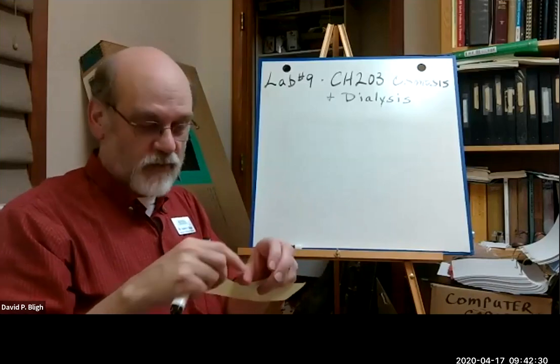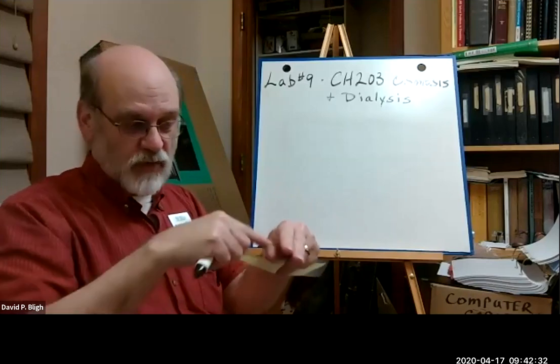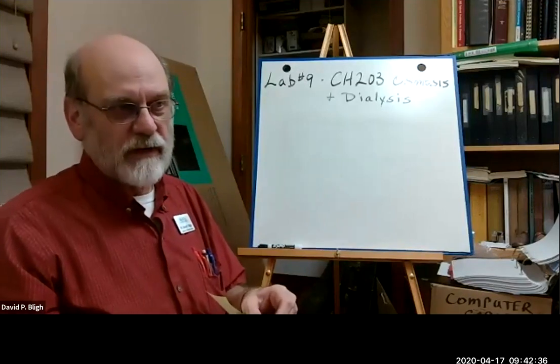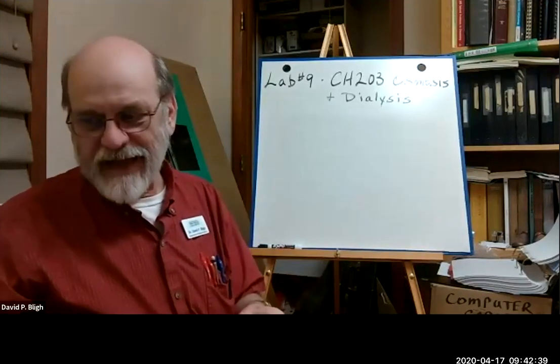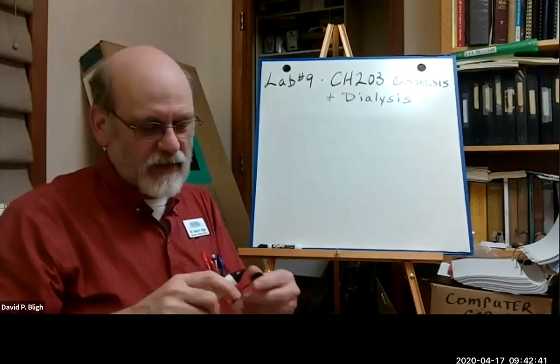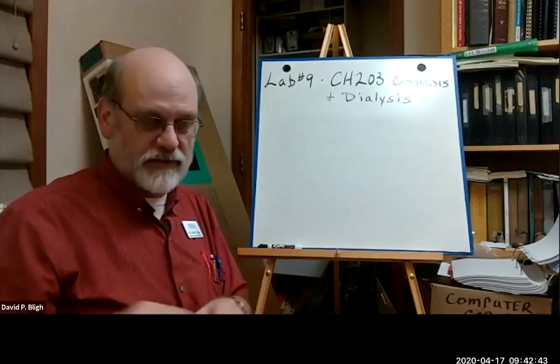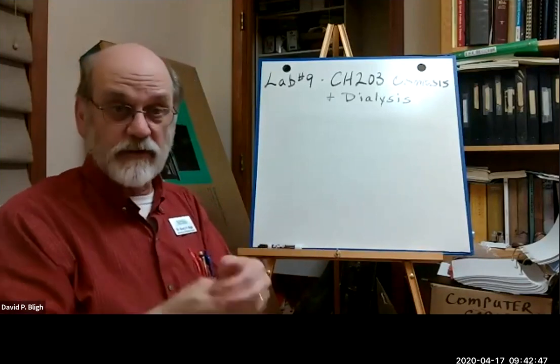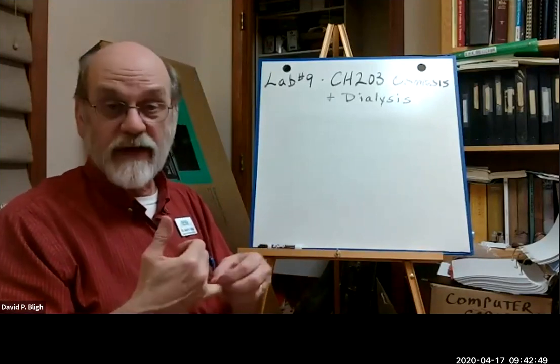Because it's flat to start with, but it's really 2 layers. So you open it up, and some teaching labs have available these clips that you can put on it. You just fold it over a couple of times and put a clip on it, and that seals off one end. We don't have that luxury.